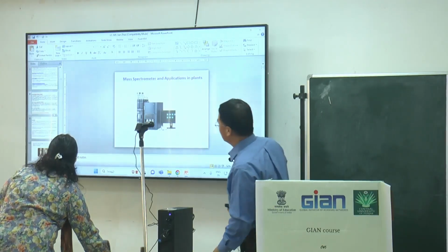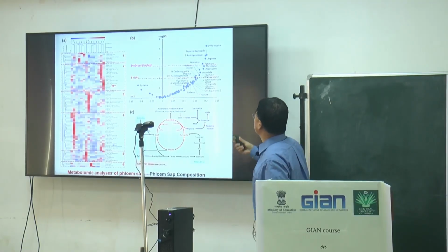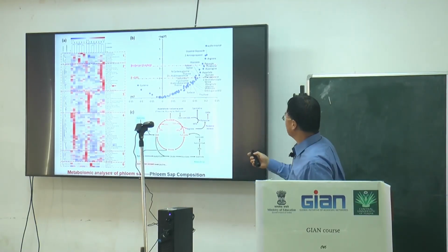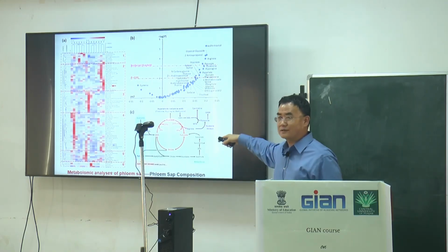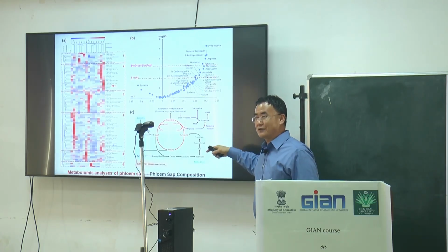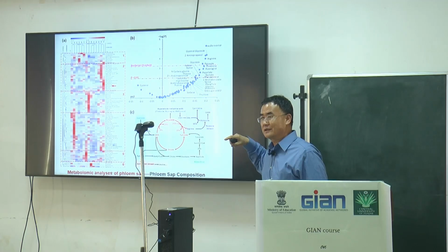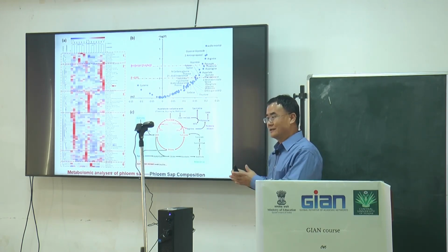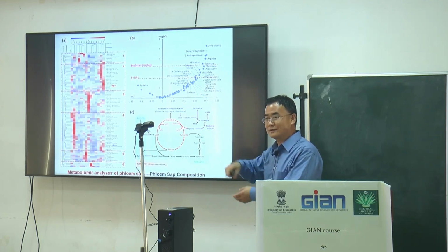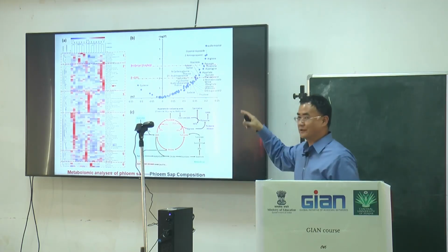The second metabolite, like... but anyway, those metabolites really tell something very meaningful. Probably, if they use a different internal standard, they can also isolate some with high sensitivity. Probably they can isolate salicylic acid and just monitor the hormones or signal molecules from the phloem.